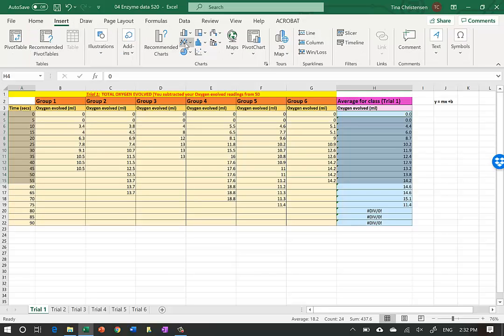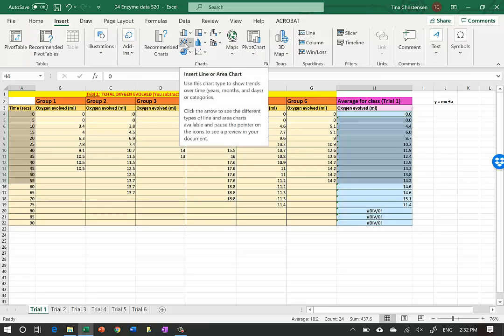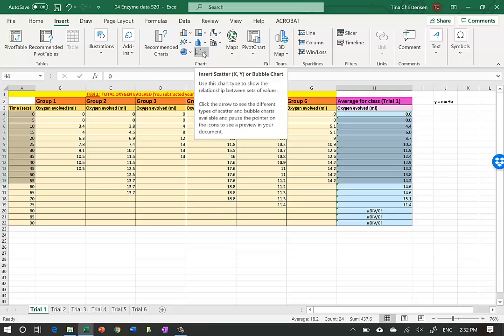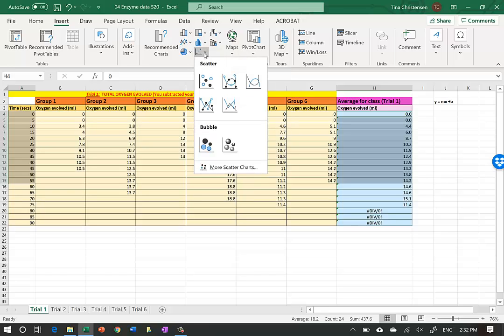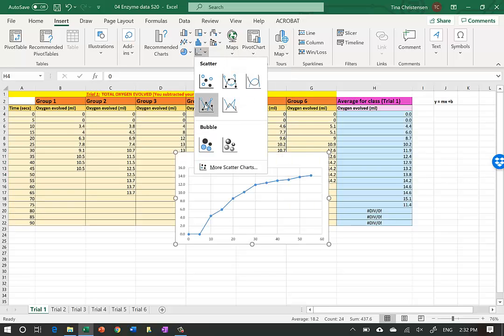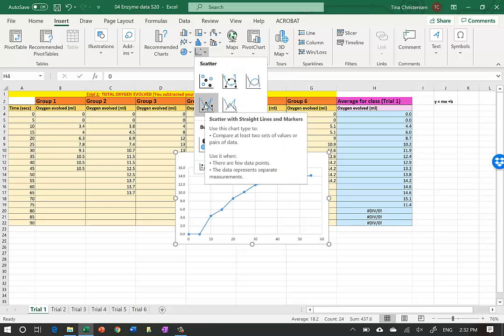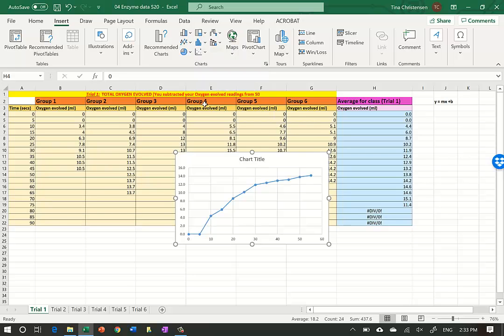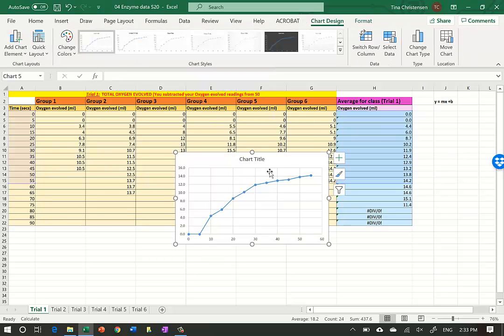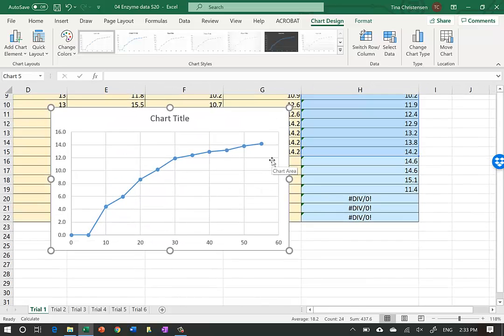I go up to Insert and click on it. I do not use a line graph - that will cause a weird-looking graph. Instead I go down to XY scatter plot and click the arrow to select the one where we connect the dots with straight lines. Here is our graph.